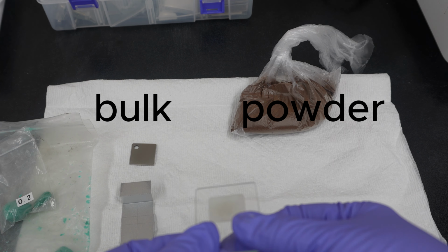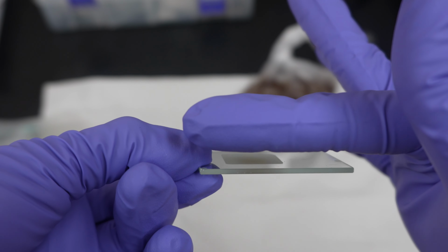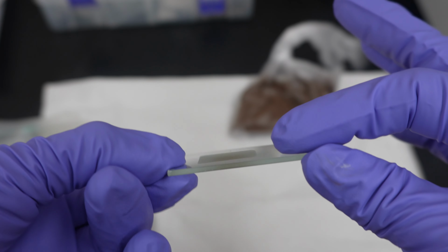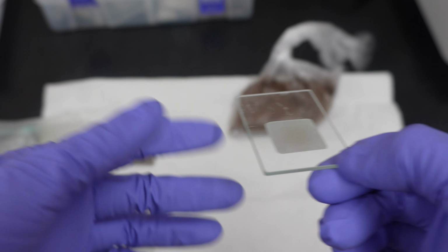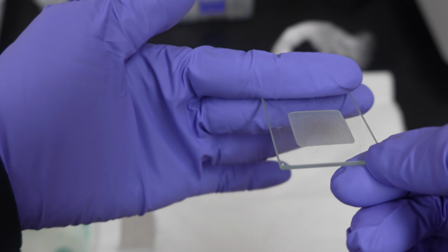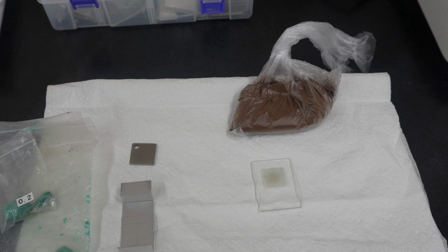And for the powder, we need this kind of Pyrex glass made from alumina or borosilicate. We will place the powder on top of this glass and then make it flat. Sometimes we need to tap, tap, tap, or press a little bit to make it more compact. And then as you see, the edge is different. So one of the edges will go to the slit in the chamber.